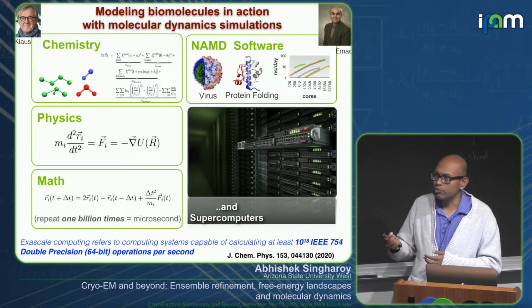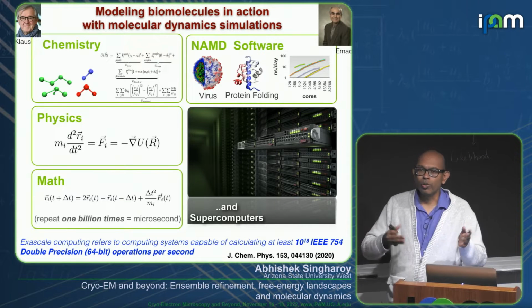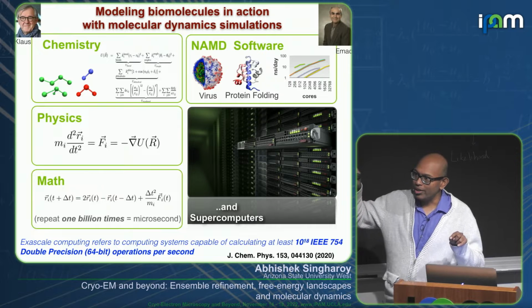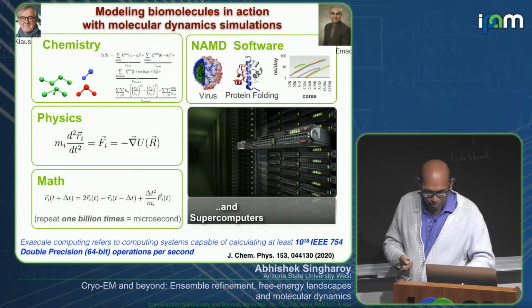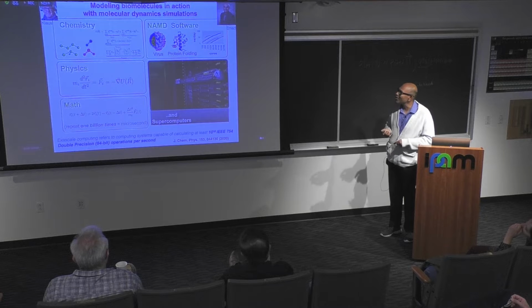That's what you call the fluctuation dissipation theorem. Normally, that's the kind of noise that you see because molecules are noisy. So a part of your Newton's equation will have to incorporate noise. And essentially, noise controls the temperature of the system. So you are essentially putting your system in a heat bath and then solving Newton's equation and hoping that you find some sort of a local minima, like a protein folding simulation. And we saw several of those in the previous slides.